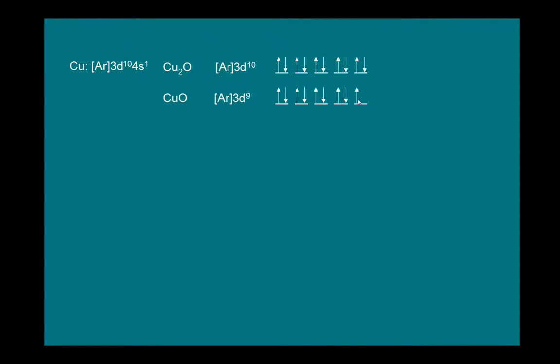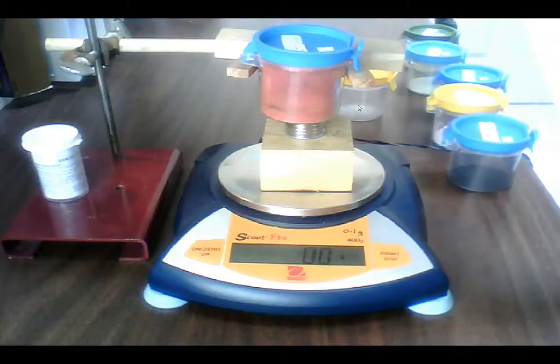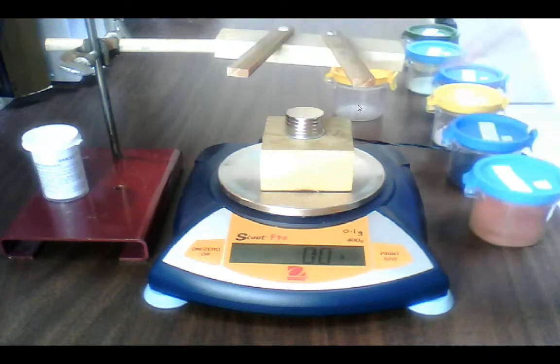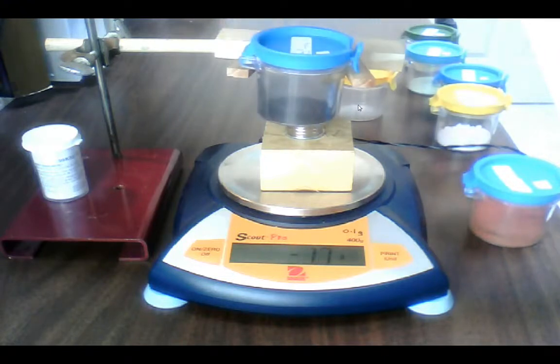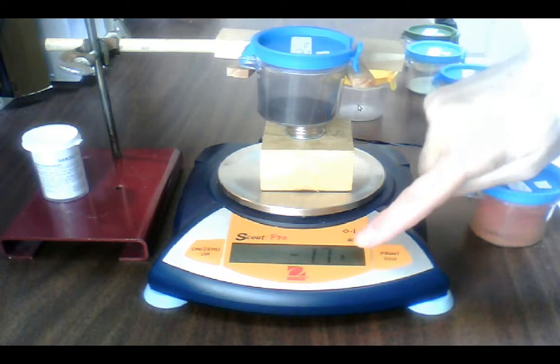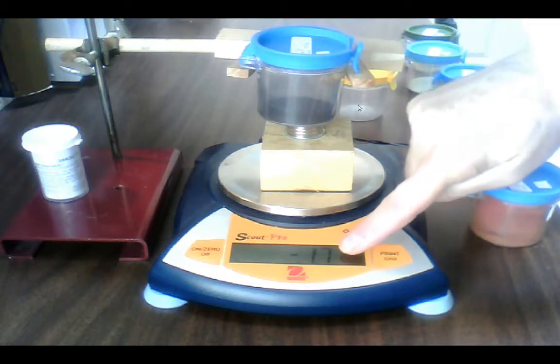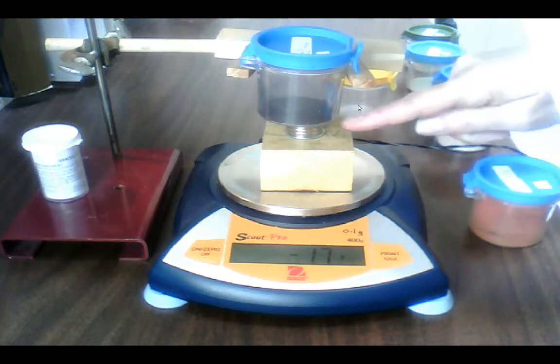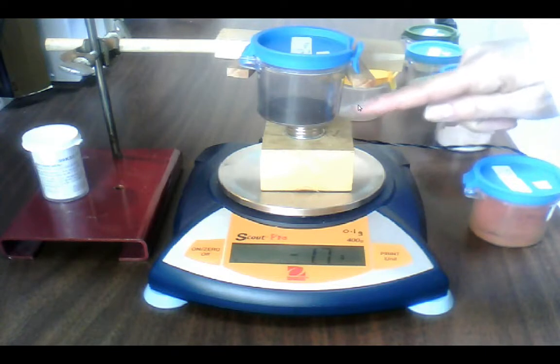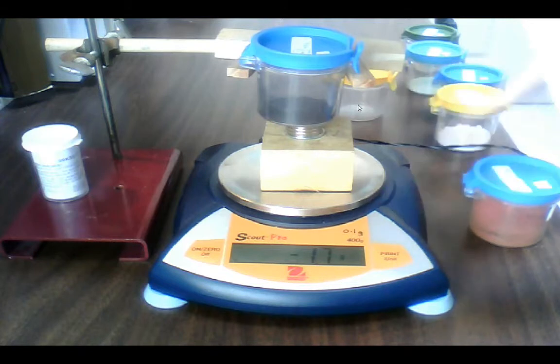Copper two oxide. On the other side, we have one electron that's unpaired, so we should see a magnetic effect. And there we see minus one point seven. The decimal is hard to see, but it's minus one point seven grams. So in other words, this assembly here, the magnet has been raised slightly, being attracted to the copper two oxide. And the result we see is a decrease of one point seven grams. So there's definitely an effect there.